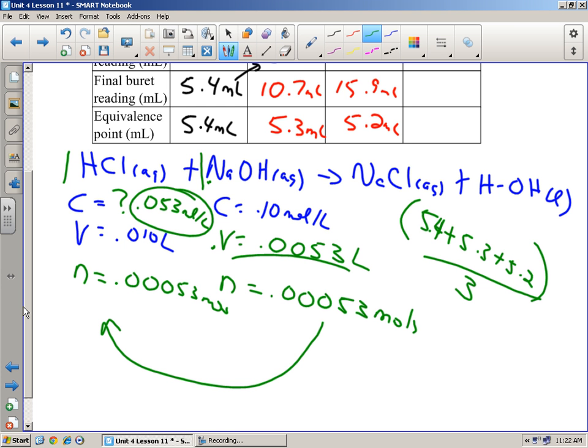So we've done our titration to find the missing concentration. Okay? Now, by the way, how accurate is this? Well, I can tell you right now, it's very accurate. I tried to make 0.05 and I eyeballed it a little bit, so I'm not going to lie to you. So it could be actually right on the money.